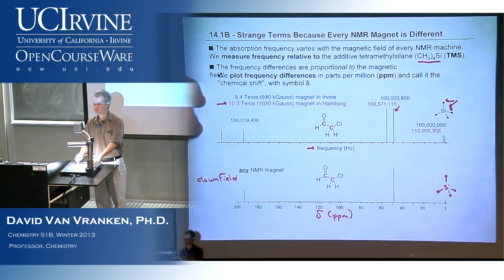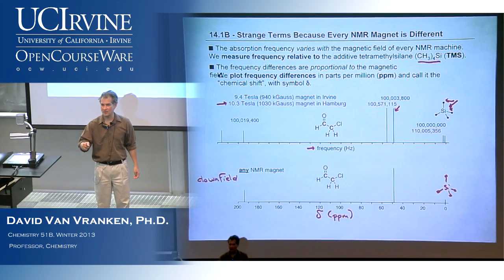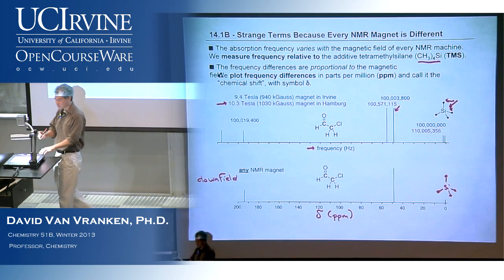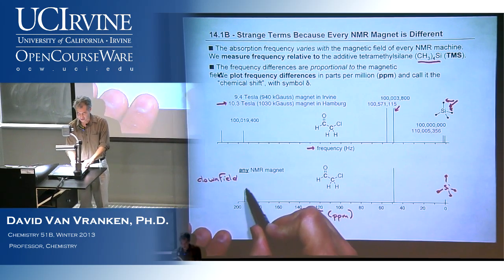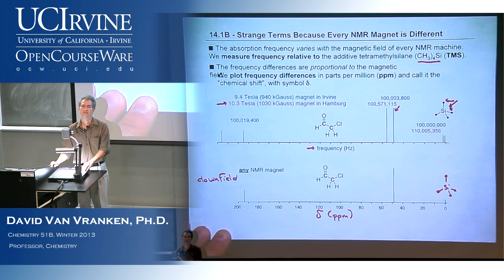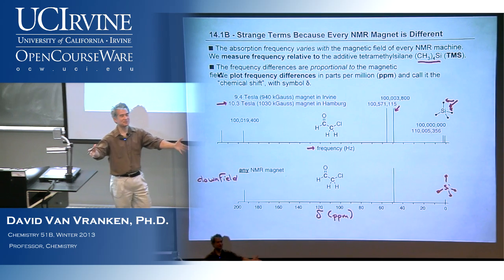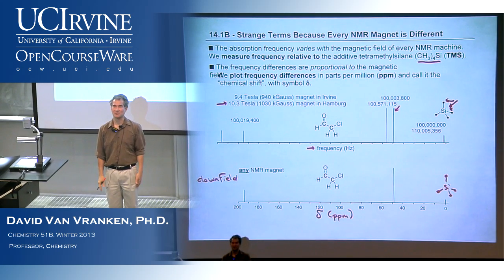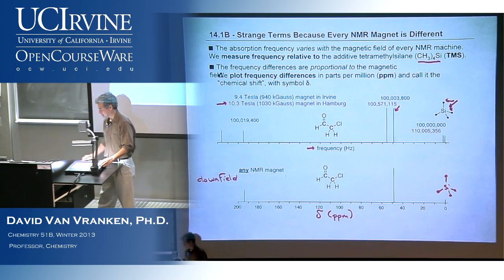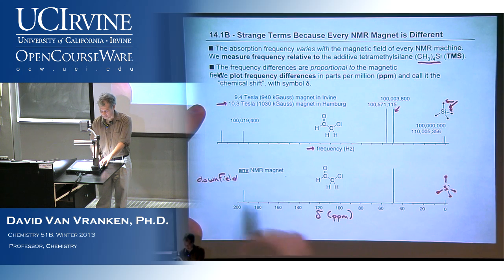It's just going to seem completely weird to you that I'm sometimes going to say, and I'm going to try to avoid it, but I know I'm going to slip, see that carbon resonance downfield over there? And you're going to say, no, it's backwards. It's backwards, and I hate that. It's going to screw you up, because when I say downfield, I mean at high parts per million. I didn't invent that, sorry. So when you hear me say downfield, I mean at high parts per million.